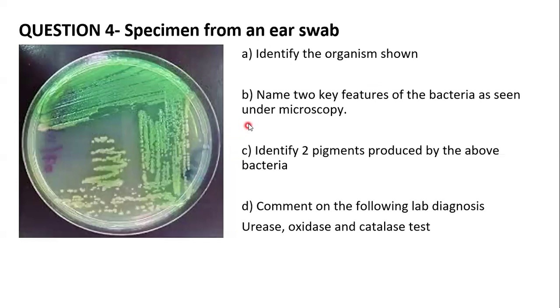I have a question. Yes. Now, this question is asking specifically for features of the bacteria seen under microscopy. So, would you be able to see motility under microscopy? Would you be able to see it's motile?